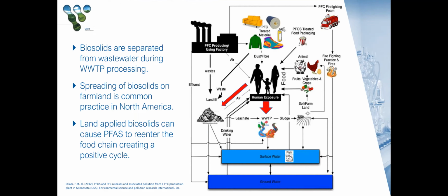So I think with that, you can see how important it is to understand this. But the issue is biosolids are a difficult matrix to analyze. They have unique interferences, which other study matrices like natural soils or aqueous samples such as surface water and drinking water simply do not have. So biosolids definitely require careful method selection, and that's what I'm going to talk to you about now.